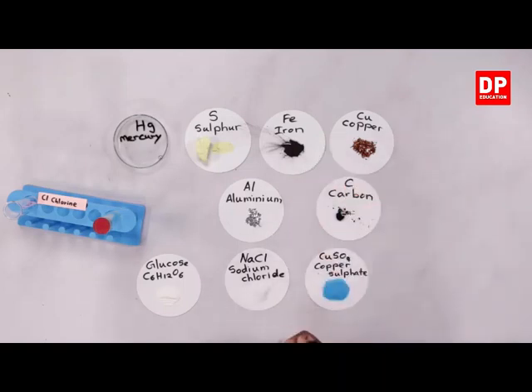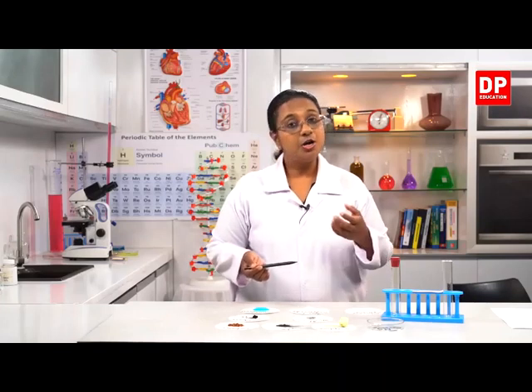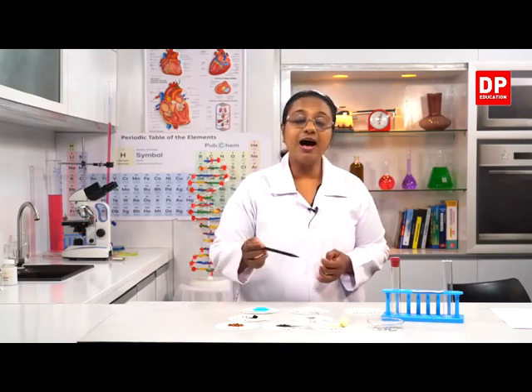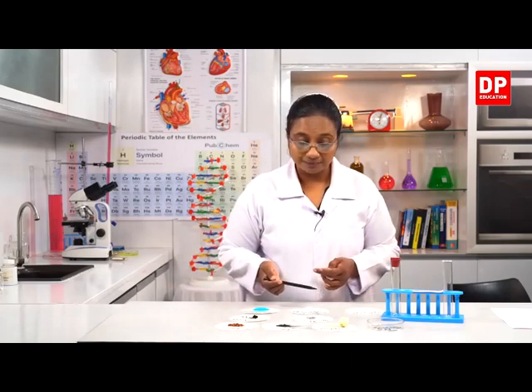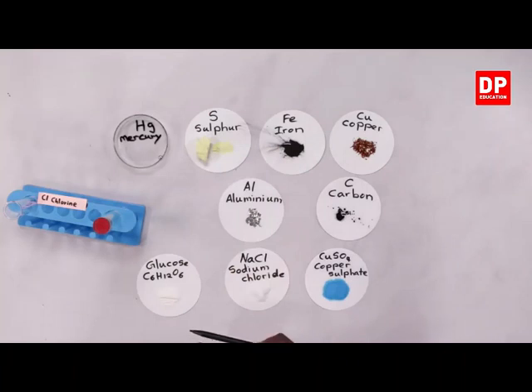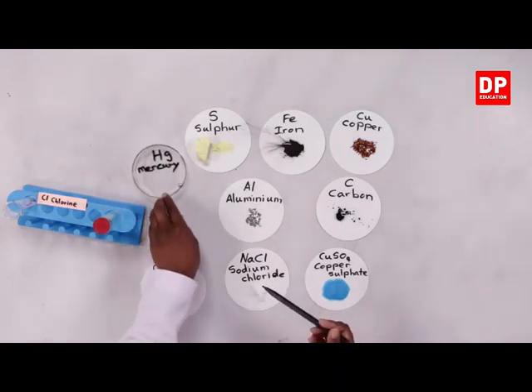Then here we have iron. Iron is present in the form of black color powder here. Normally you all know the iron objects which are made up of iron. They are solids. Here it is the iron powder that is shown to you and the symbol is Fe. Then here I have another element that is sulfur. The symbol is S. And here you can see that again is a crystalline solid substance, yellowish color crystalline solid substance.